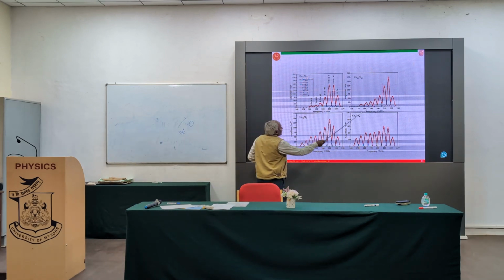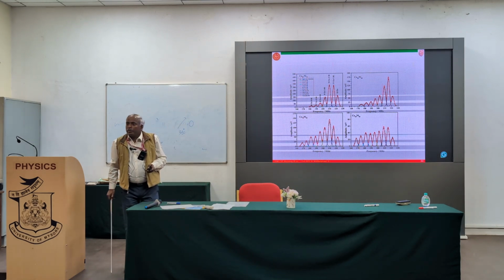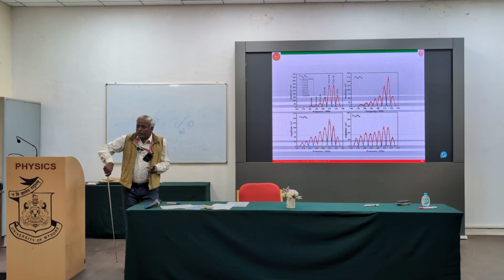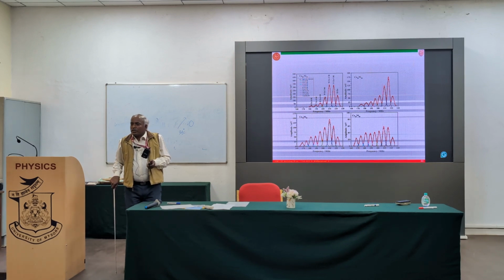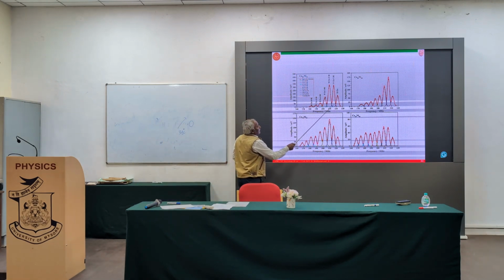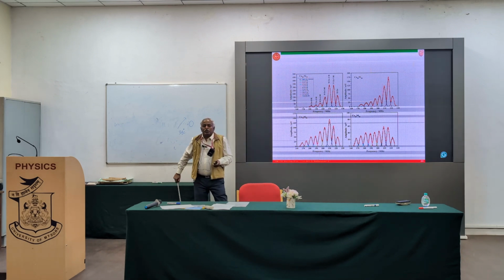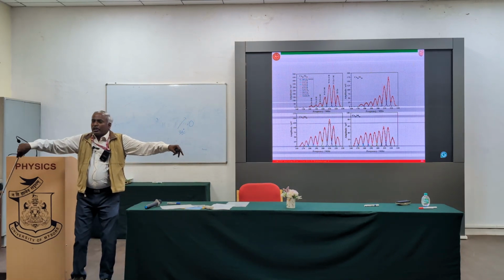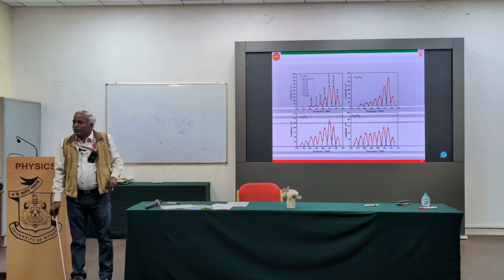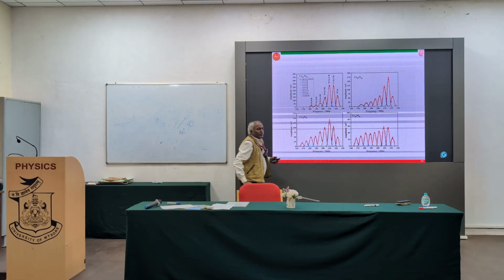He was able to identify how many neighboring atoms are contributing to each signal, how many cobalt atoms and how many nearby nickel atoms are contributing. As you can see, all the peaks move towards higher frequencies, and as we keep on increasing the concentration, all of them are distributed equally. Therefore, the nickel is going and occupying all the cobalt nearby sites. You can draw different conclusions out of this kind of behavior.